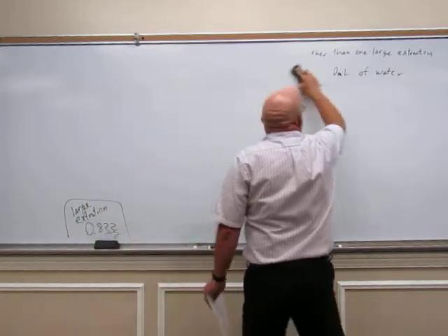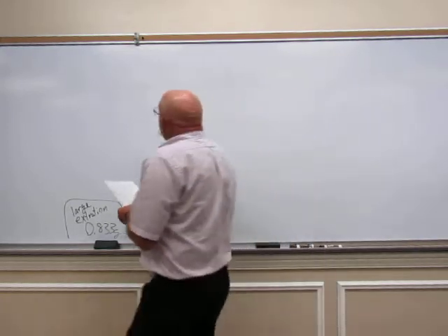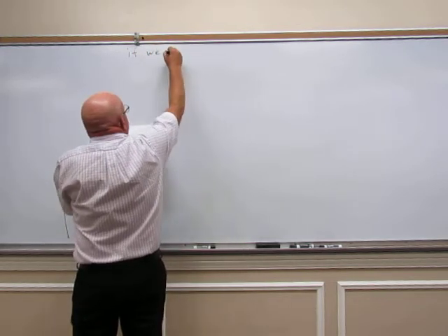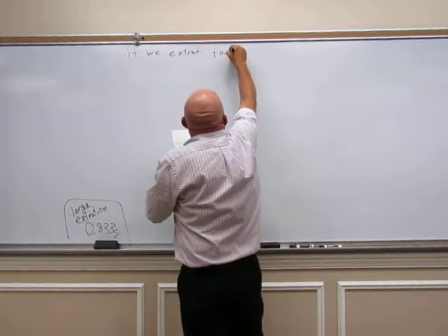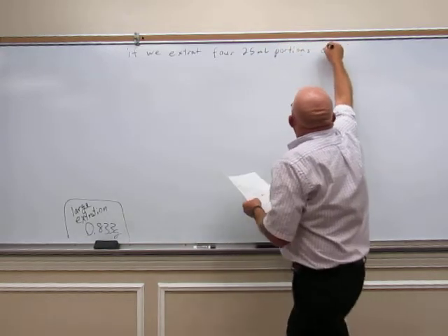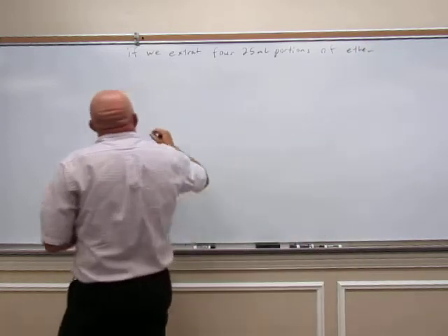So, again, I've mentioned that it's better to do several small ones. So let's look at 4 small extractions of 25 mils each. Okay, our first extraction.